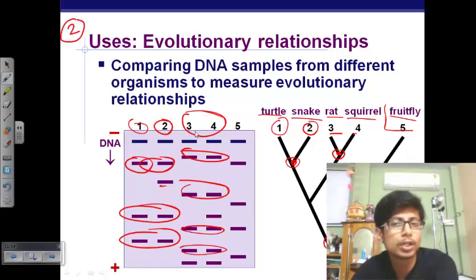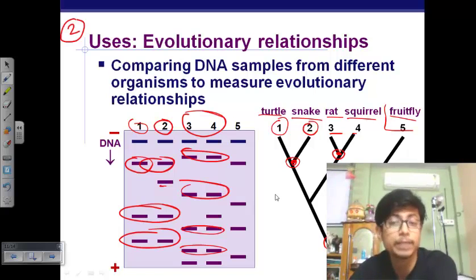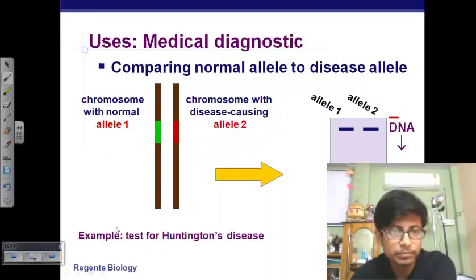And nowadays we don't use this single experimental process to analyze the evolutionary relationship. We use bioinformatics, we use protein study, DNA study, we use morphological study, and all those studies compiled together to give the idea of evolutionary relationship. But this type of electrophoresis and analysis of DNA definitely acts as a very positive experimental science to place them in the same or different group.